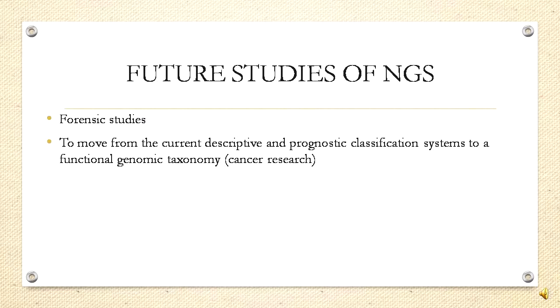Another potential application of the next generation sequencing is to improve the diagnosis of cancer, as we know that poor tissue sampling and processing can often make a histological diagnosis difficult. However, next generation sequencing-based analysis of tissue can be performed on small amounts of viable tissue and is accurate when sufficient information regarding the causative mutation is known.